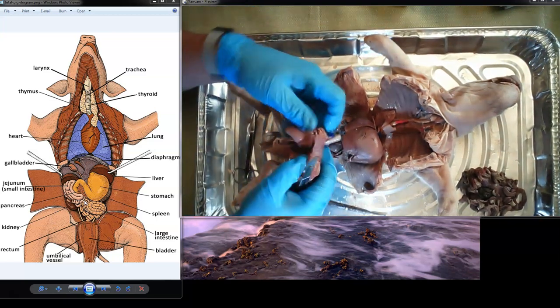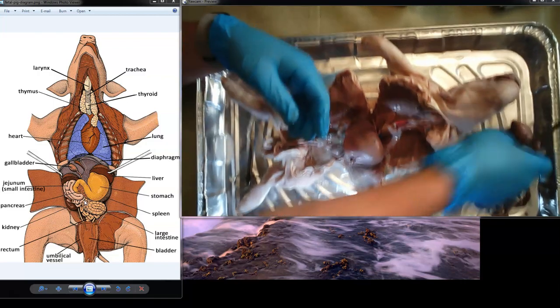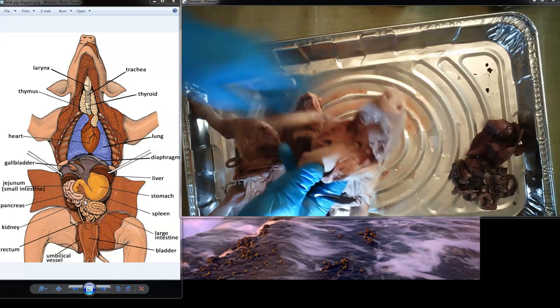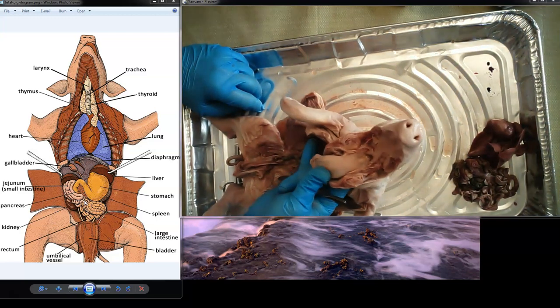Okay. So the heart here. Actually, I'm going to leave this connected. Use one glove, okay? It just makes it easier, so we don't waste. All right. So here we have the mouth of the pig again, and I'm going to make my way into the brain. So I'm going to ask my son to pause the video. We're going to make our way in and we'll just show.